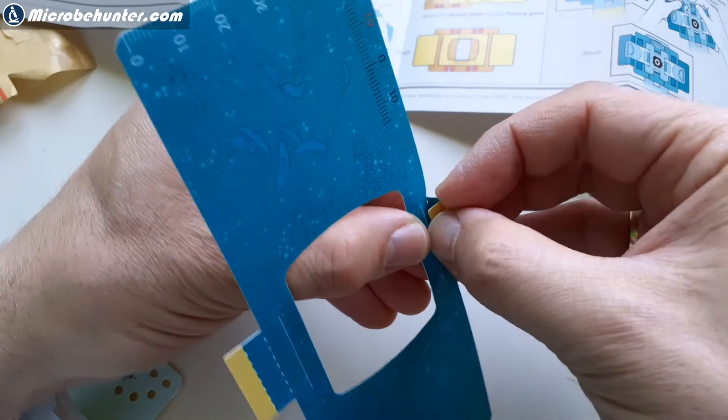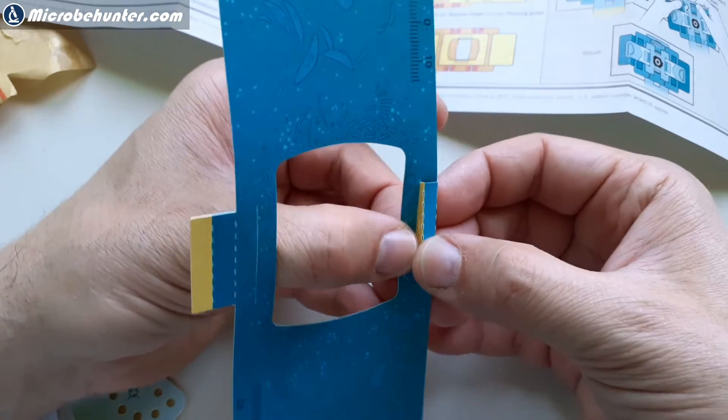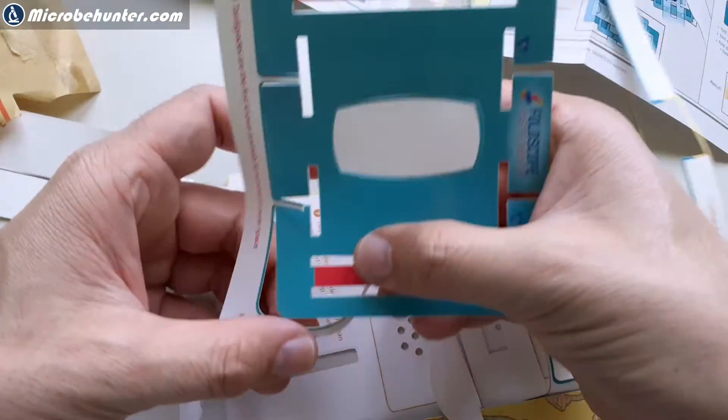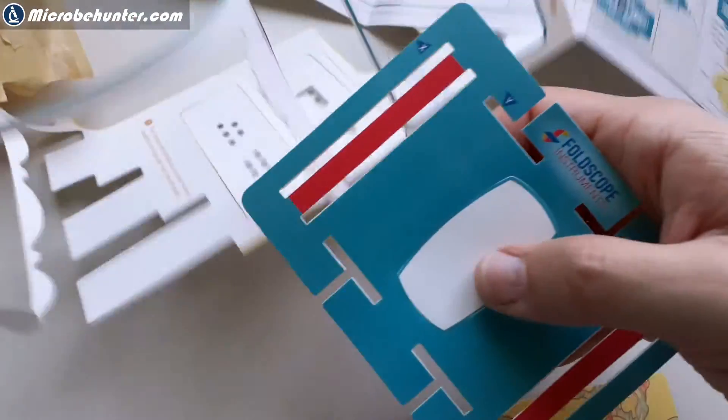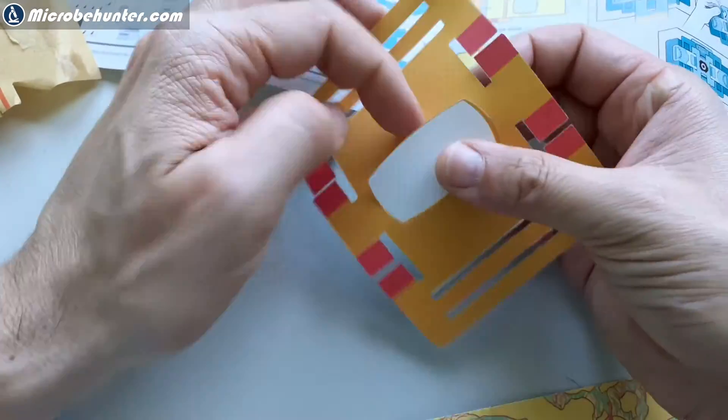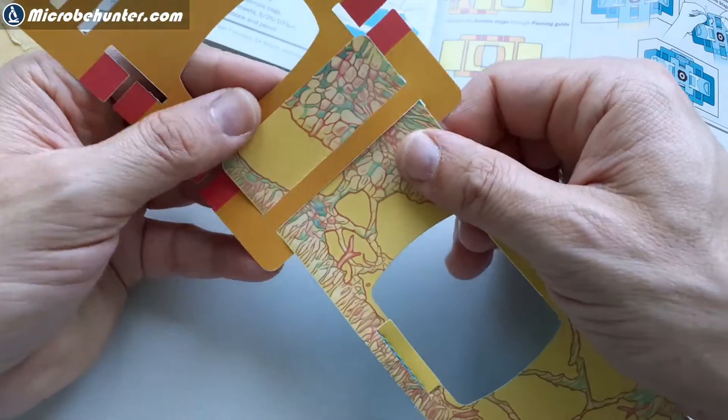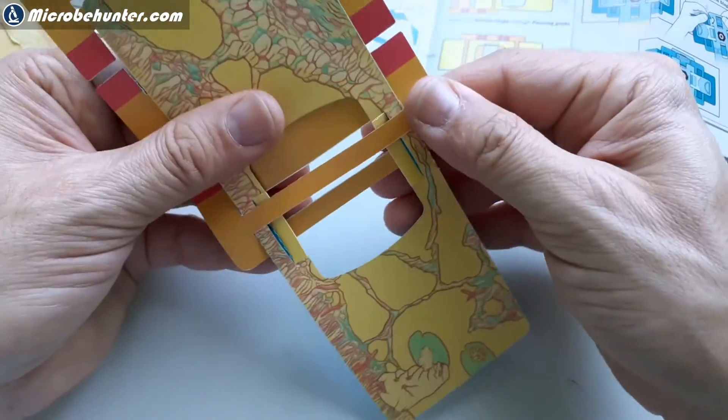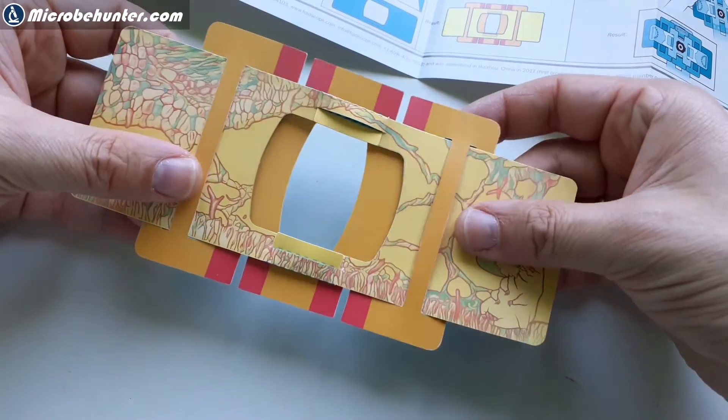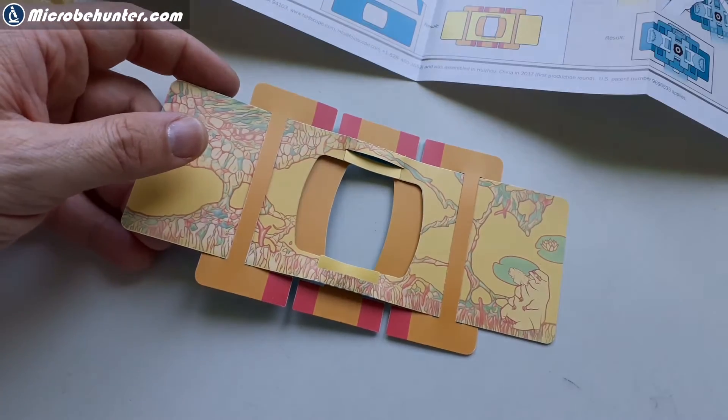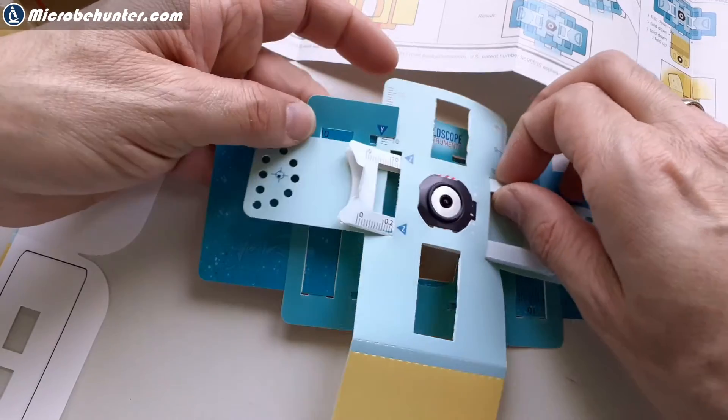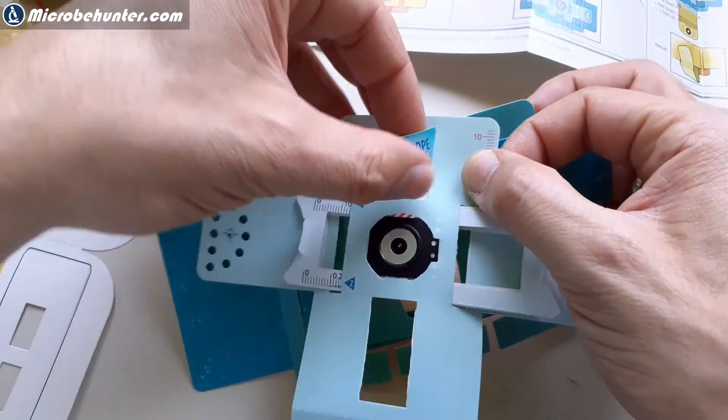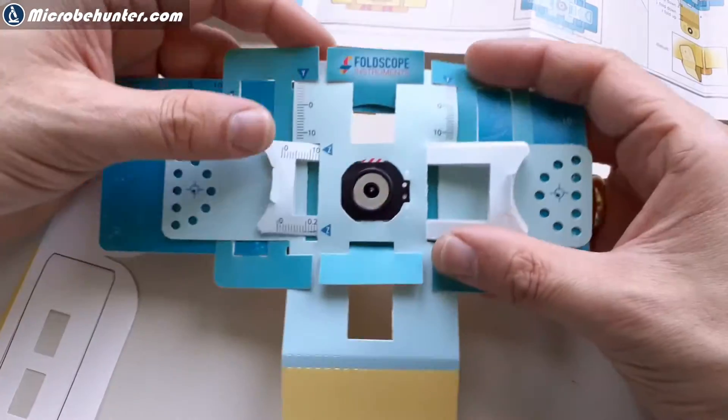I have to insert this here through the slits. And what I also want to say is that, of course, a single lens microscope like this, you cannot expect very high image quality. I mean, so it is not a replacement of a real amateur microscope. It doesn't want to be, it doesn't have to be either. And I would say that it's still an interesting project. And I can imagine that this is actually pretty nice and good gifts for, even for science-interested adults. If you want to give a little birthday present to someone and you don't really know what it should be, then you just give him or her a Foldscope because it's already a classic, so to say. And for people especially who already have everything. So, I would say, in that sense, it's a nice gadget to have as well. But because I already have my microscopes, I'm not going to be using this now to do nature observation. I mean, I'm just going to, yeah.